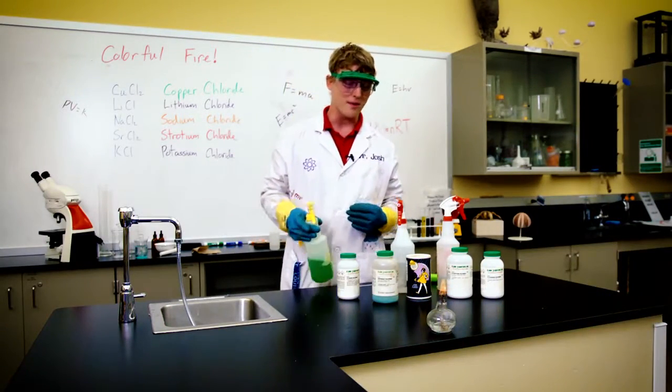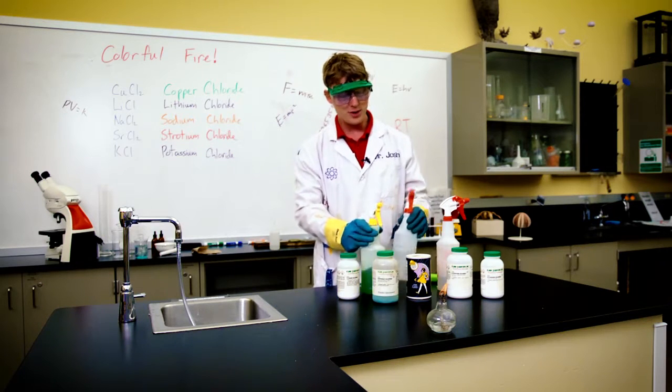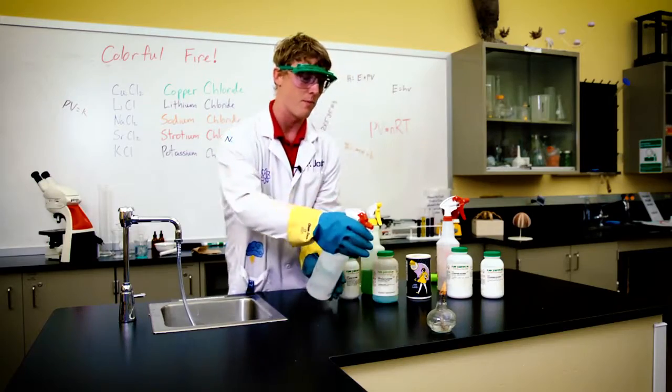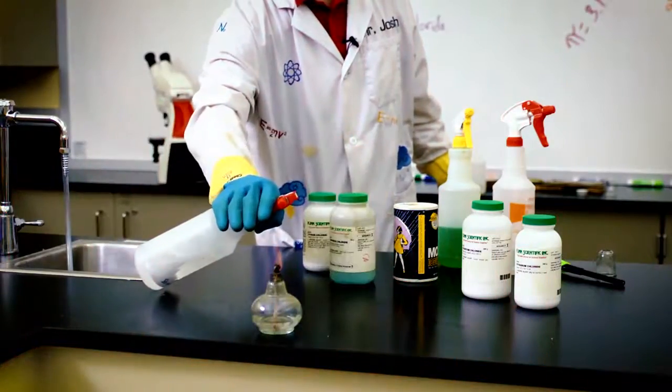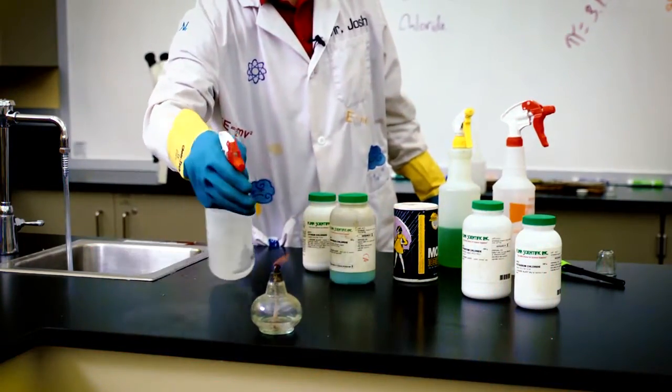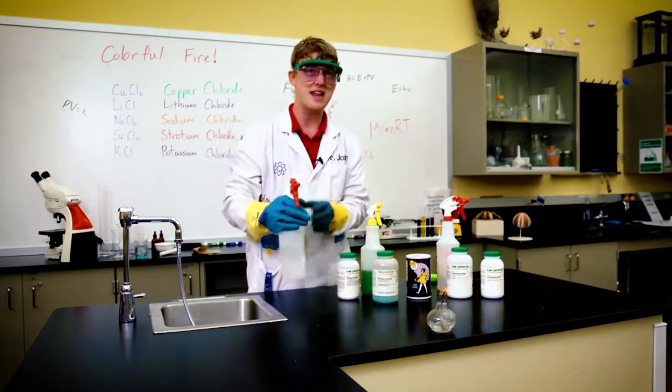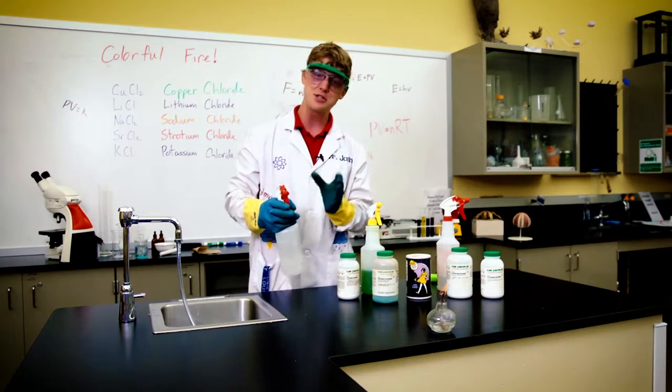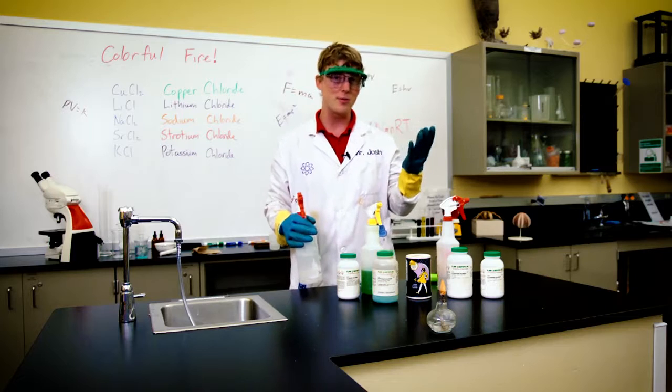This is where we started and then I started thinking, I wonder if any of the other colors would work. So I took strontium chloride and dissolved it in this one. See what happens. And you get that nice bright red color. If you do try this you'll actually notice the strontium for whatever reason burns a lot hotter and you'll be able to feel that a little bit.